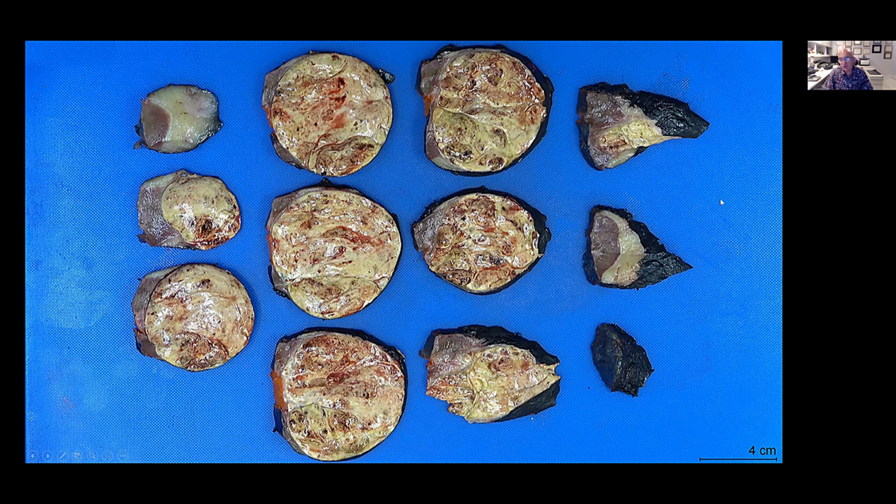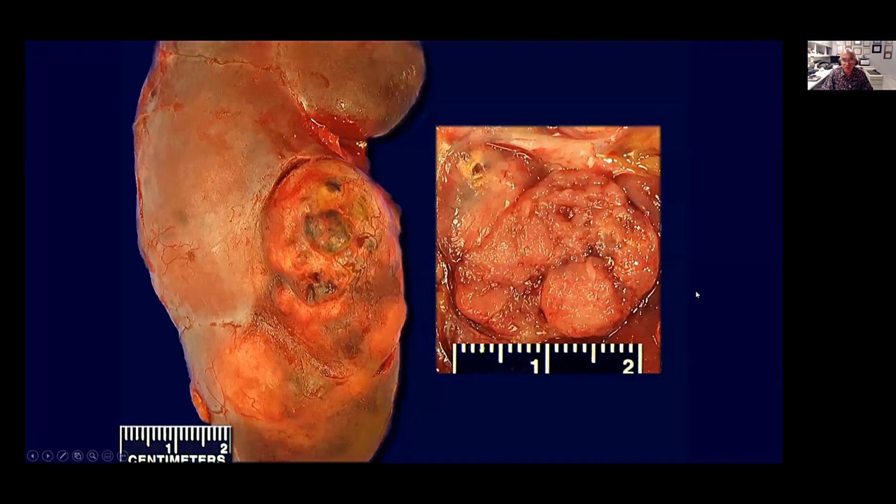But sometimes we may find invasion in the slice, and if we don't have good documentation with pictures, then it's going to be difficult to make the correlation. And the other way around, sometimes we don't find any invasion, and then in the picture we see that the tumor is really perforating or is at the margin. So that's why I consider that these images are very important.